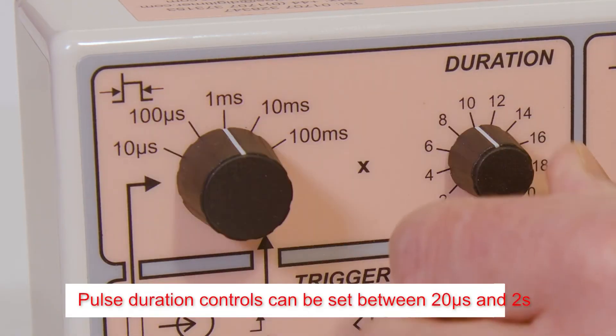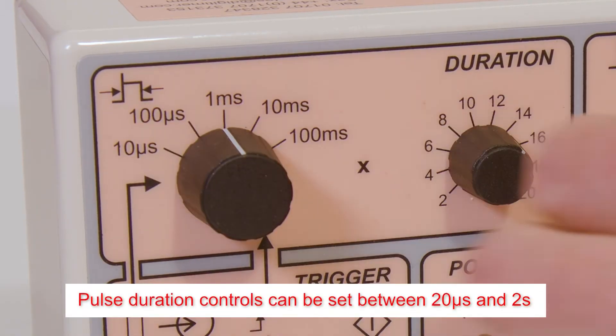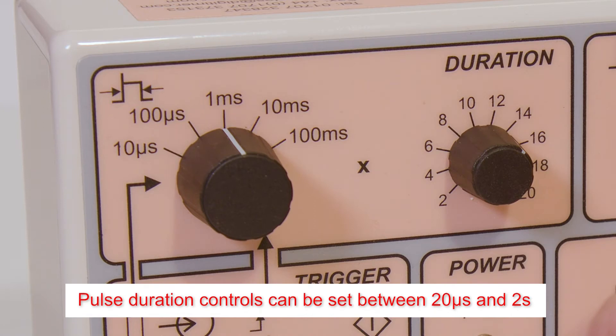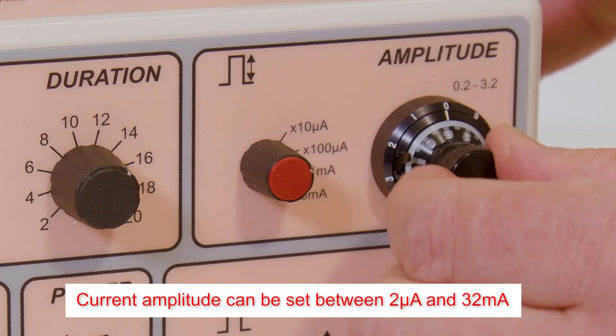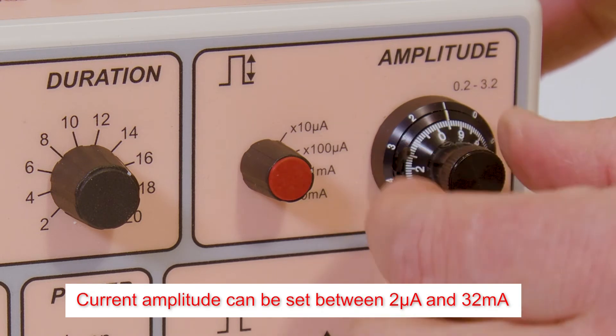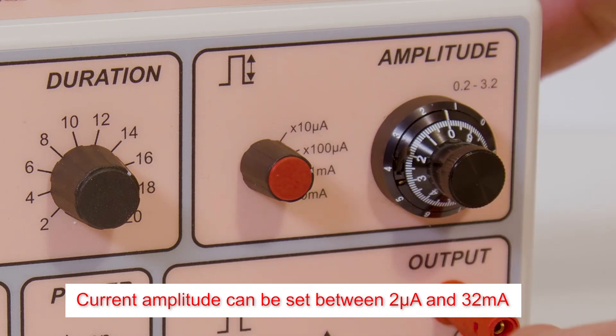A rotary switch and variable dial provide control over the pulse duration, from as little as 20 microseconds up to 2 seconds. A 3.2 turn precision dial and range selector switch provide current amplitude control from 2 microamps up to 32 milliamps.